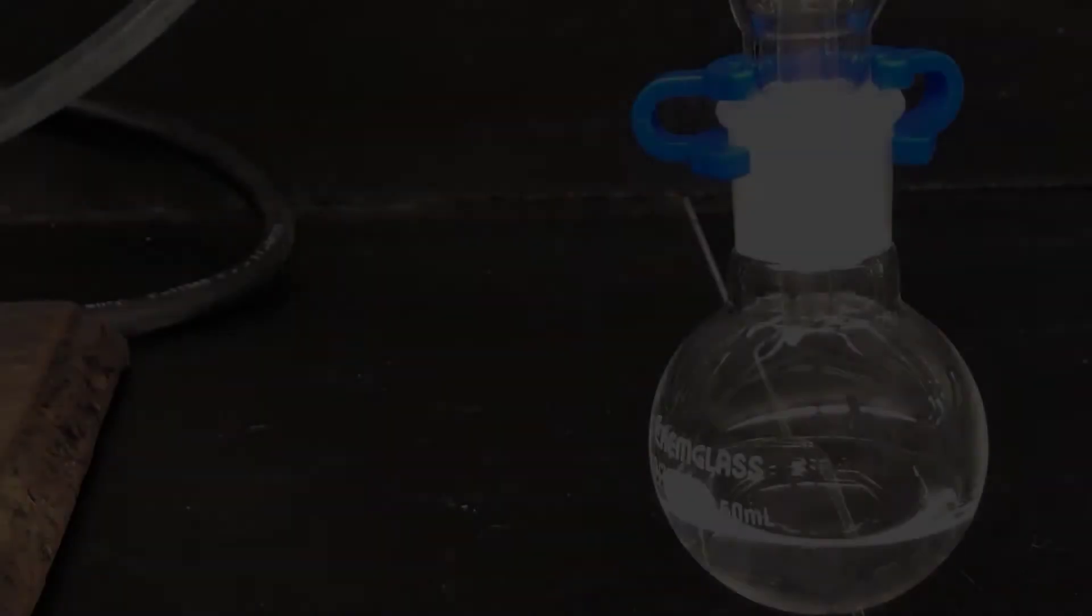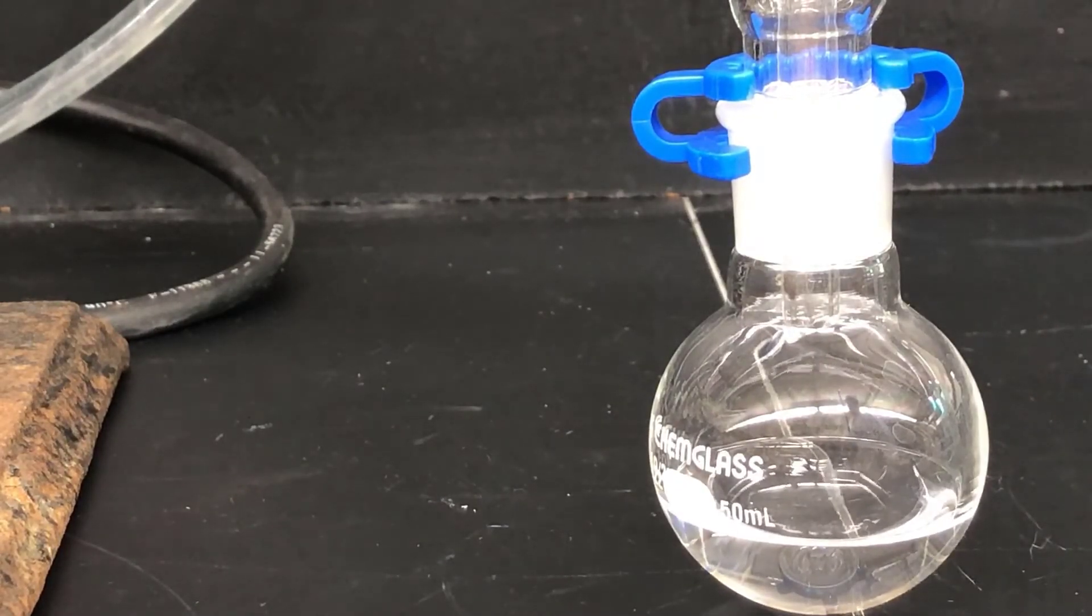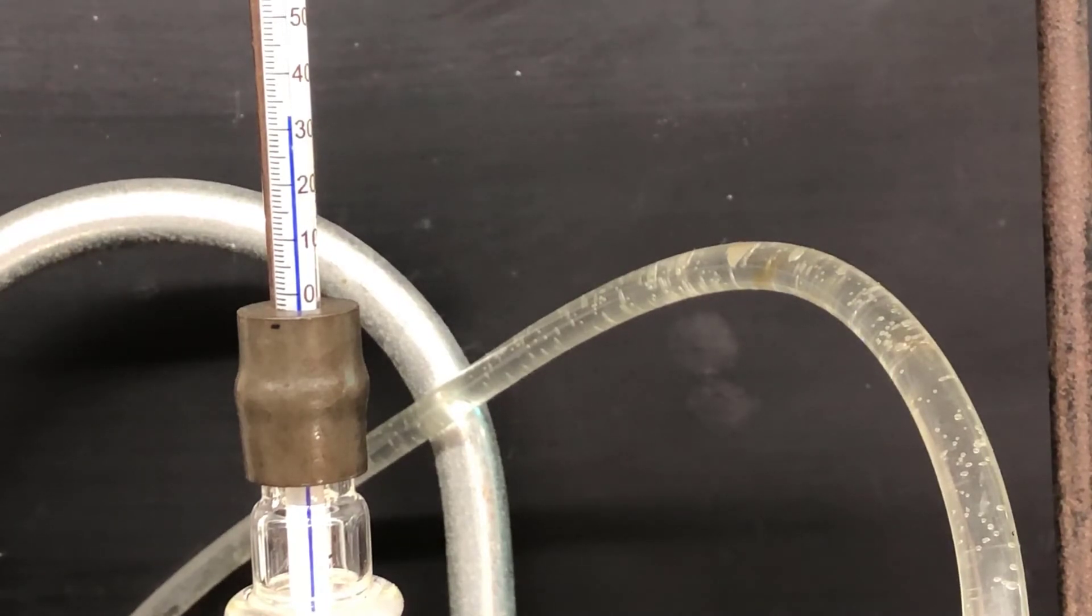As the distillation nears completion, you'll notice the drip rate slowing significantly, as shown here. You may also notice the temperature on the thermometer beginning to drop, because there isn't enough vapor coming over anymore to keep the thermometer warm.